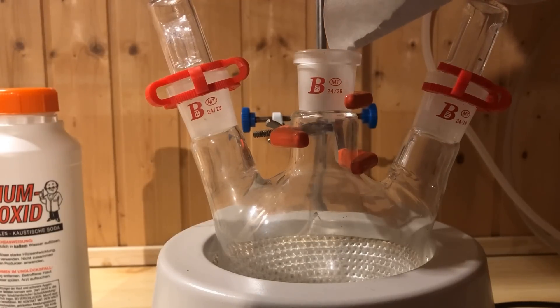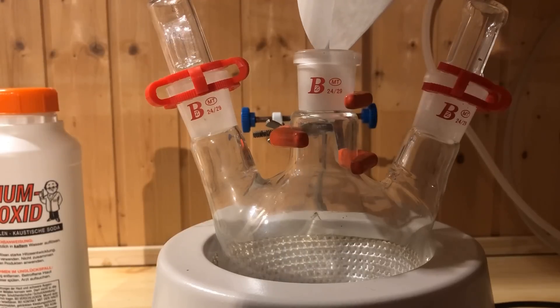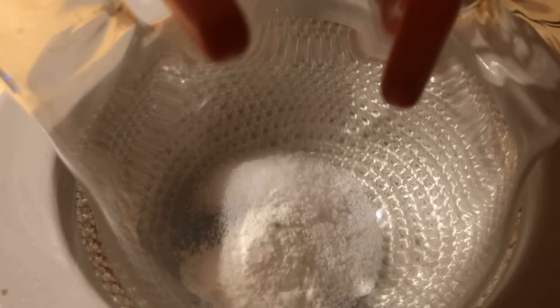To start, 30 grams of zinc powder is added to the flask, followed by 20 grams sodium hydroxide. The third substance added is 2 grams phenolphthalein.